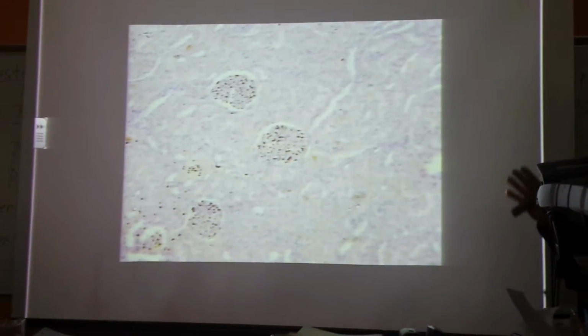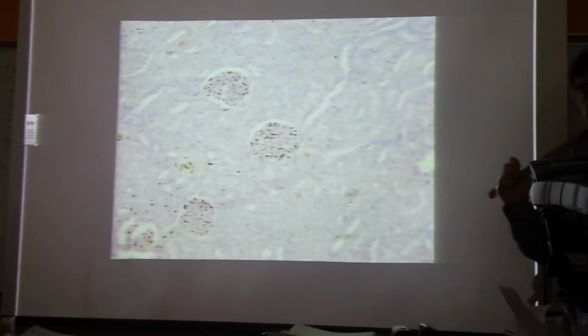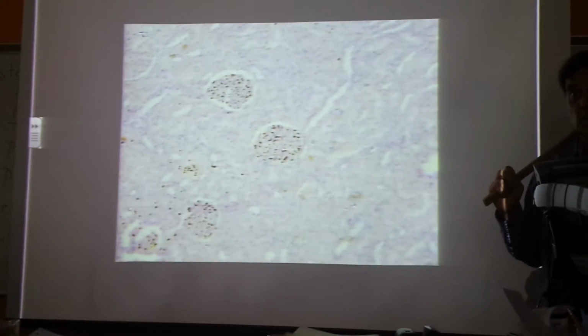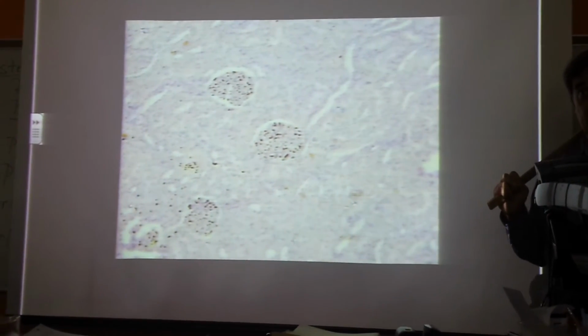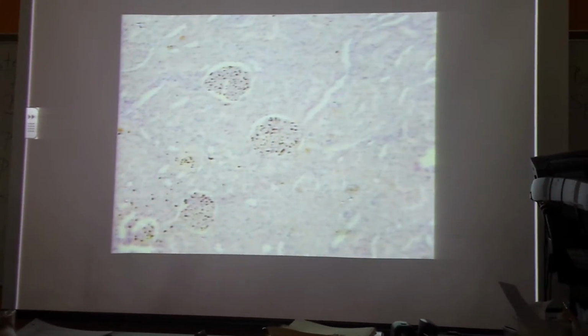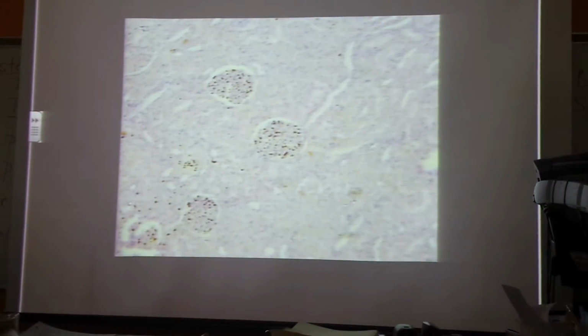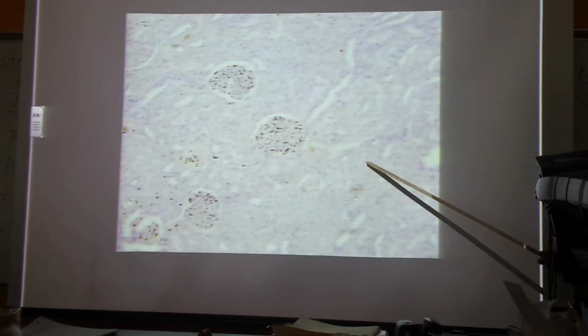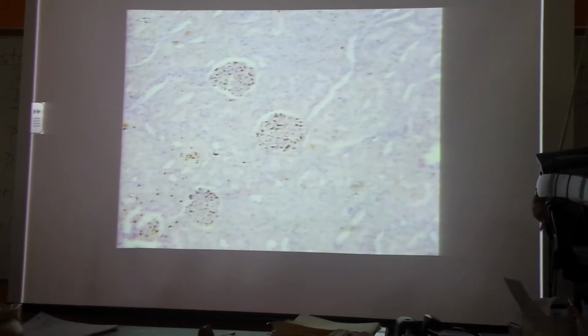Okay? We have a tube in here that's not part of the nephron, in the cortex. Where does the urine go from the distal convoluted tubule? Into what? The collecting duct. So that's not part of the nephron. All right? We also got blood vessels there too. What capillaries do you have in the cortex? What blood capillaries?